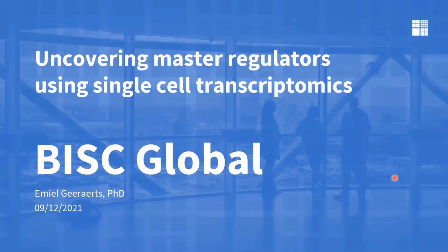Good. So I'll talk about uncovering master regulators using single-cell transcriptomics. Today we're going to dive deep into single-cell sequencing and gene regulatory networks. Don't worry, I'll introduce both topics first, after which we'll dig deep into one of my favorite tools for this kind of analysis. It's called Scenic. I will end with two real-life case studies where we applied Scenic to help clients.